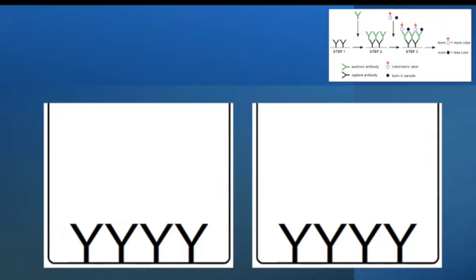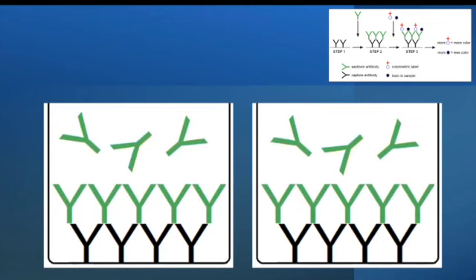For our example here, we are going to designate one well as a high toxin concentration, like what we would use in our highest standard, or a sample that would be very toxic. We'll also designate a low toxin concentration, which would be our lowest standard, or a sample that is not very toxic. All right, let's clear those up. The first step is to add our Saxitoxin antibody. As you can see here, there is an abundance of antibody, where some are captured by the capture antibody. They settle down and get stuck to the plate, but there is still some floating around in the liquid as well.